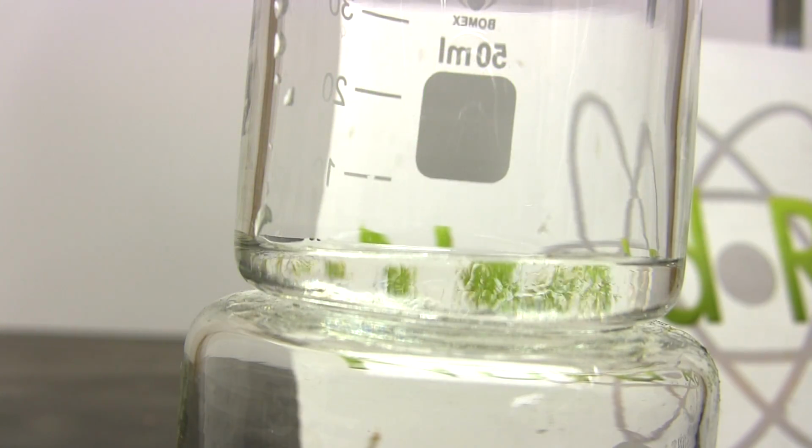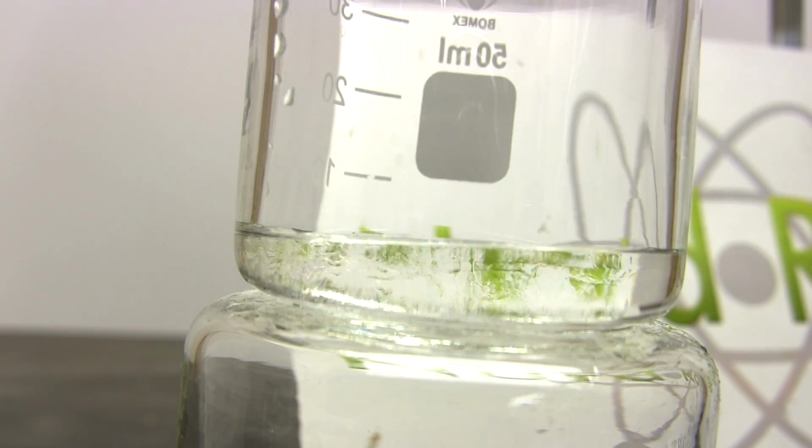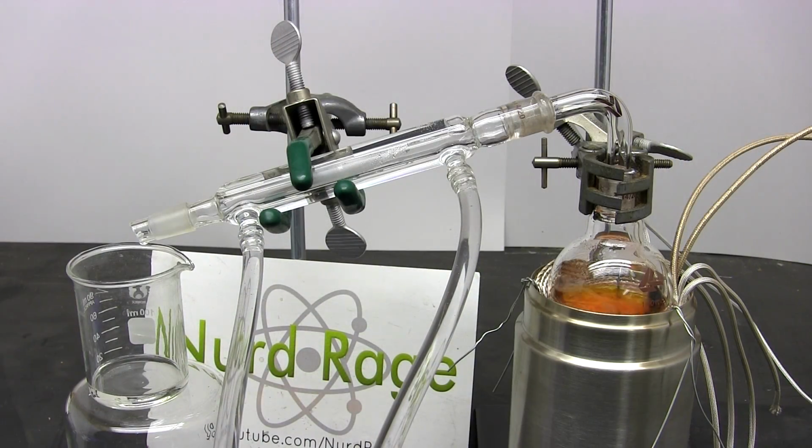The less pure but still clean acid can be applied to uses where you can tolerate water or where you're going to dilute it anyway. Alternatively, you can add it to future distillation runs to get higher purity.